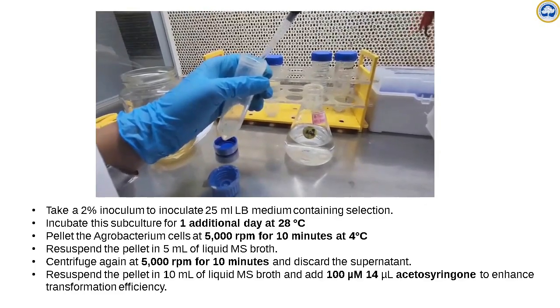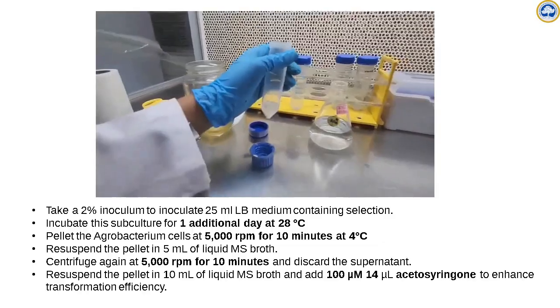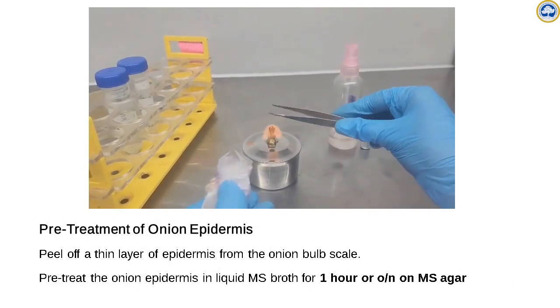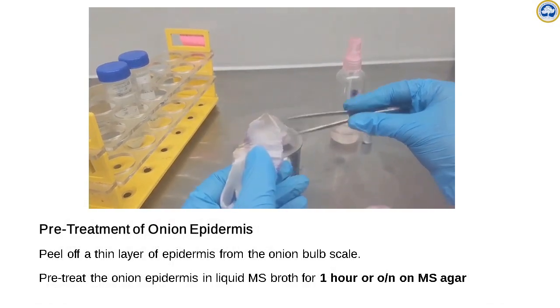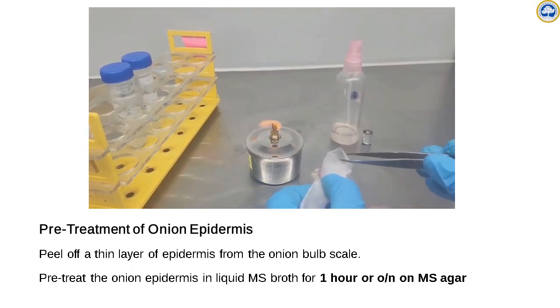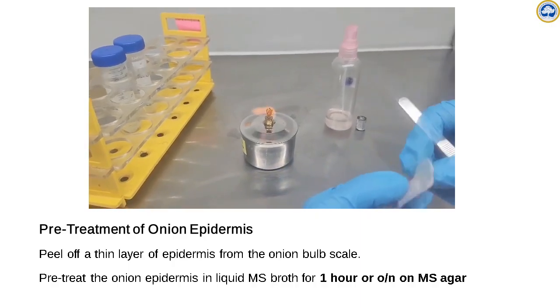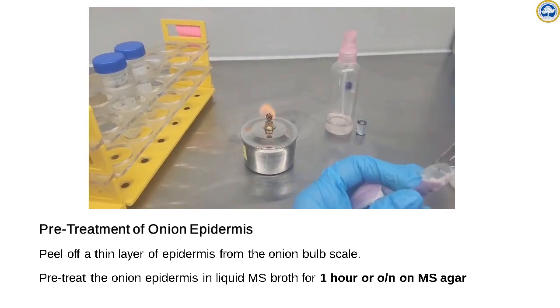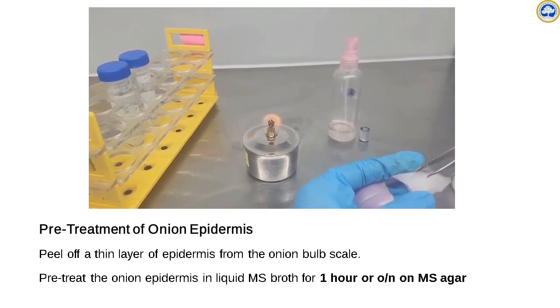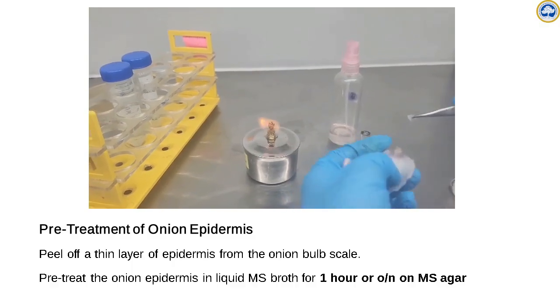Acetosyringone is a phenolic compound. It acts as a chemotactic agent which initiates the agro infection process. So the preparation of onion epidermal cells is after surface sterilization. The onion scales are cut and the epidermal cells are removed from these scales. The removed onion epidermis is then incubated in MS broth or media. It can be for 1 hour or it can be even overnight.